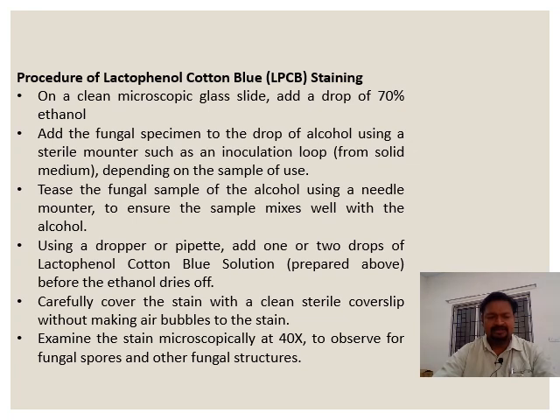For example, cotton wool, dissolve phenol crystals, glycerol additions and filtration. Finally, for storage after preparation, mix and keep at room temperature and away from the light for subsequent usage. It has a 52 weeks shelf life from the date of production under these conditions. After purchasing, the lactophenol cotton blue should be stored in the original container at 15 to 25 degrees in a cool, dark and dry place. Under these conditions, the product will be stable until the expiry date.